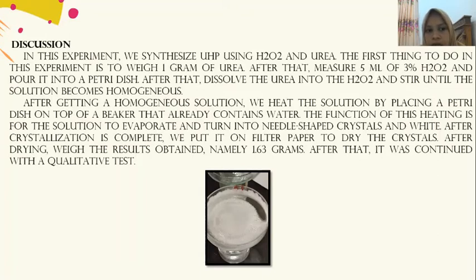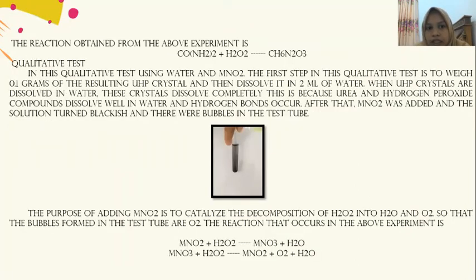After drying, the result obtained is 1.63 grams. After that, it was continued with a qualitative test. The reaction obtained from the above experiment is CO(NH2)2 plus H2O2, and the result is CH6N2O3.